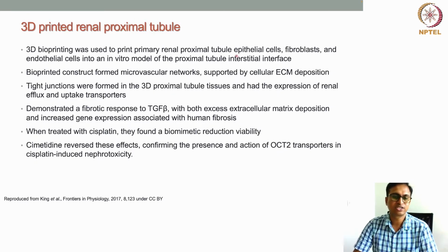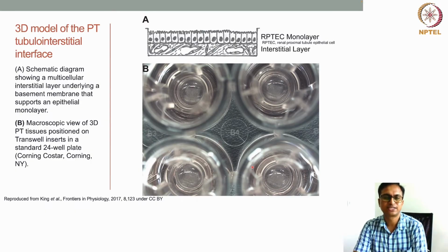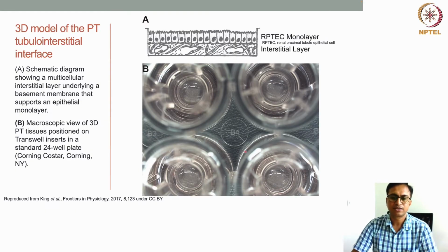So this is also another study where 3D bioprinting was used to develop a proximal tubule interstitial interface by 3D bioprinting technique. It has this schematic, which shows how the RPTEC, the renal proximal tubule epithelial cells, were printed on top of this, and the interstitial layer was printed where the endothelial cells are there, and they create this kind of vascular structures right within the interstitial space layer.